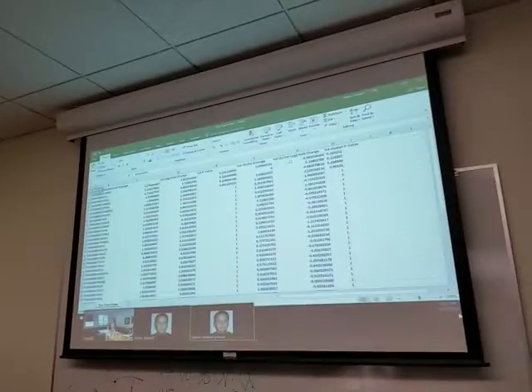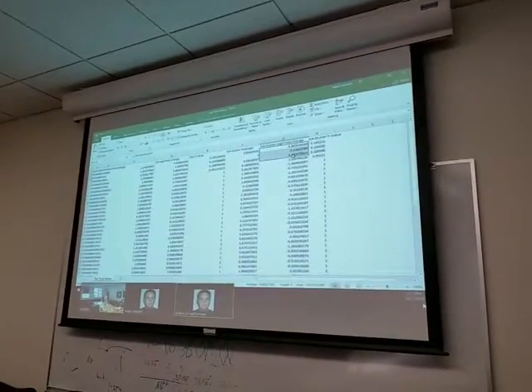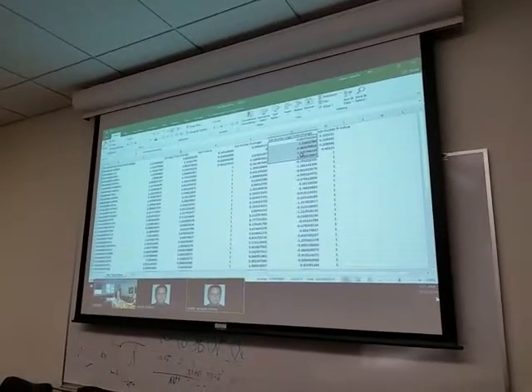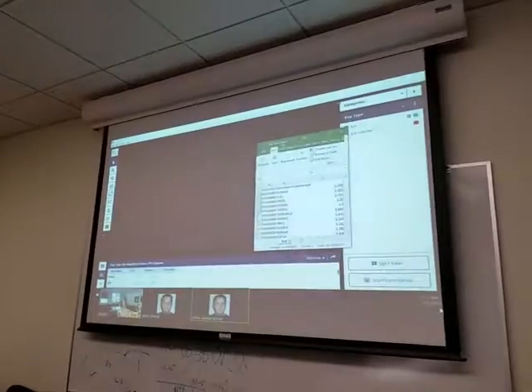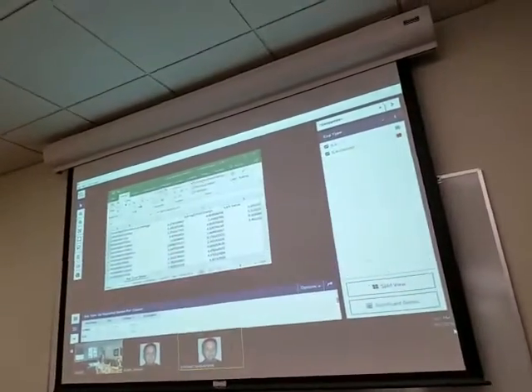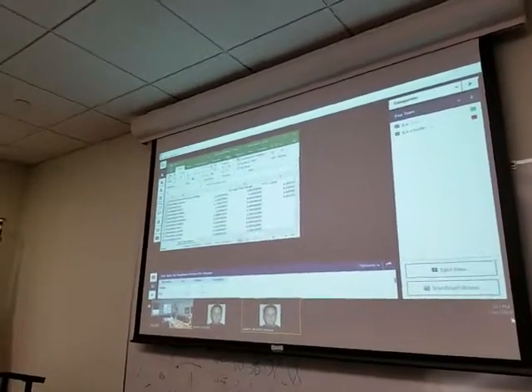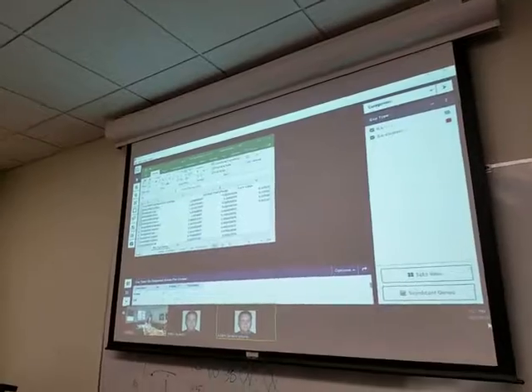Yeah, so in this case, this one's right now sorting with ones that are underexpressed in that little cluster, whatever color that was. I think that's an advance. In red. Yeah, we can do this. The problem is that these are receptor. Oh, okay. Now we can do this, but it's good to know how to do it.